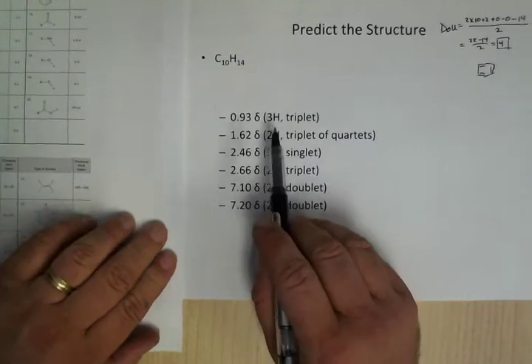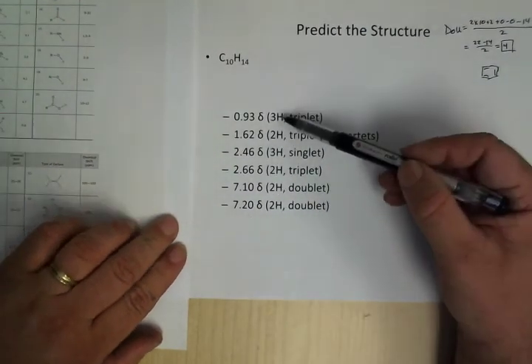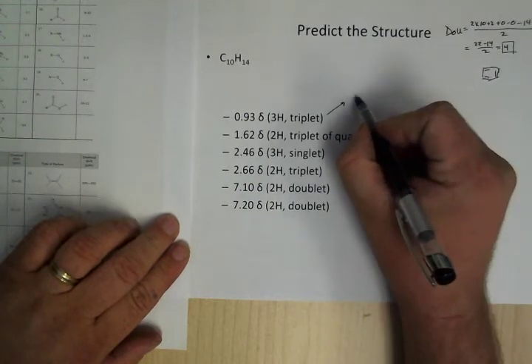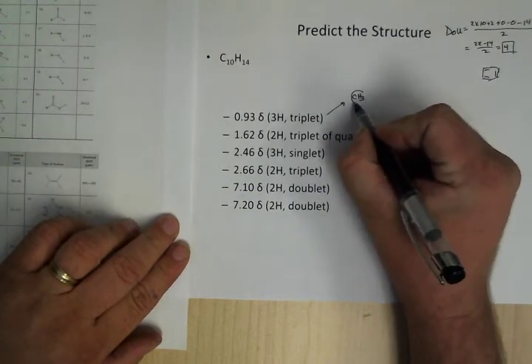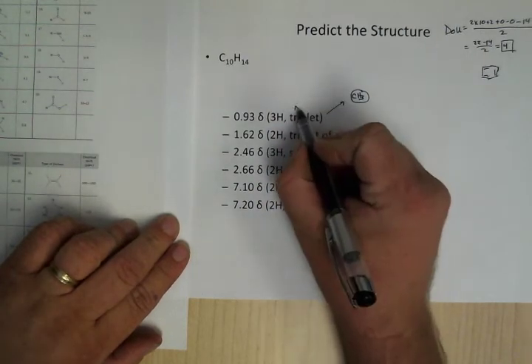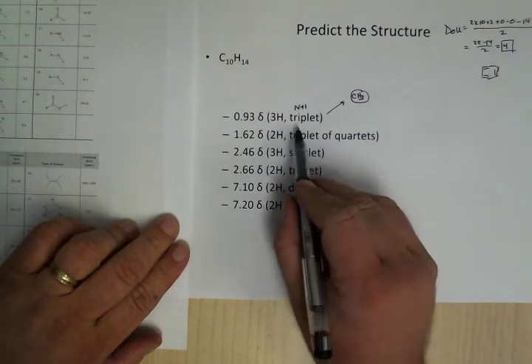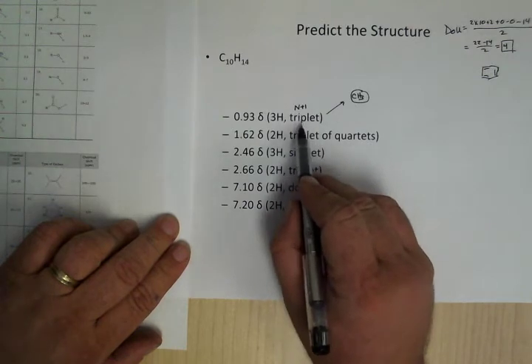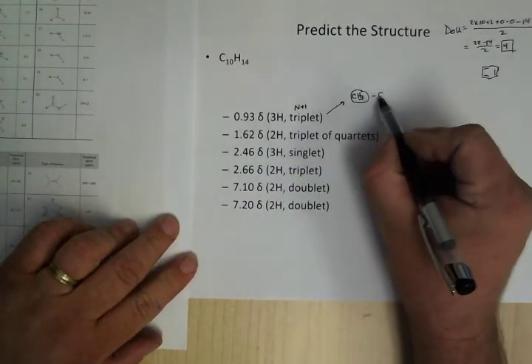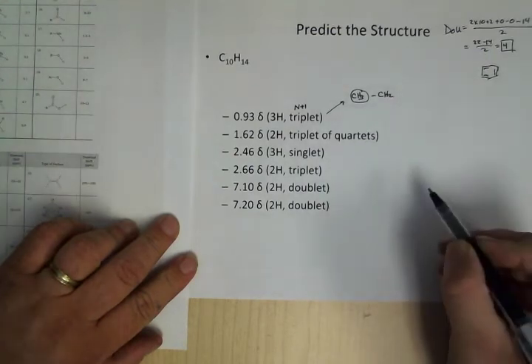Okay, so here, usually what I do is I'll start with the integrations. This one here, it's a CH3, right? So you can start with that. Now, the triplet, remember this is the n plus 1. So n plus 1 equals 3 for the triplet, so n is 2. So this must be next to a CH2 group.